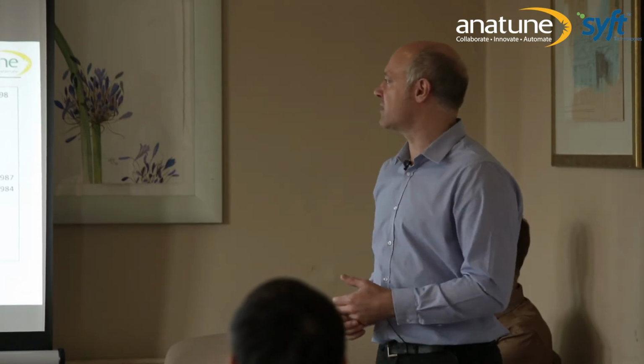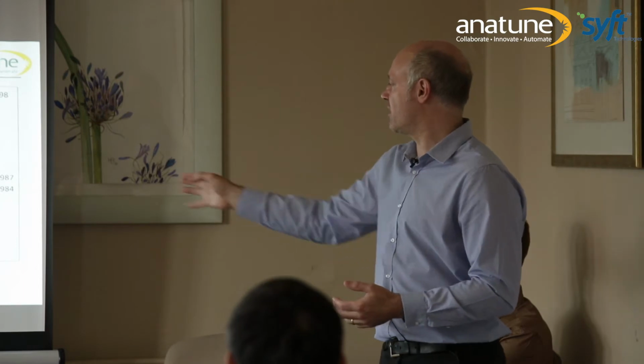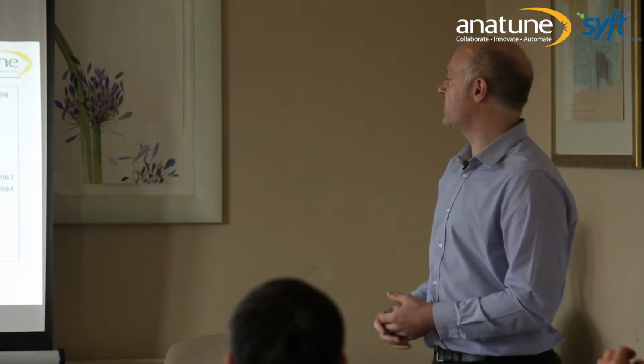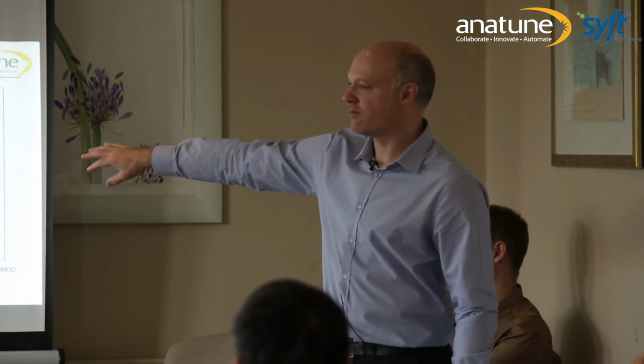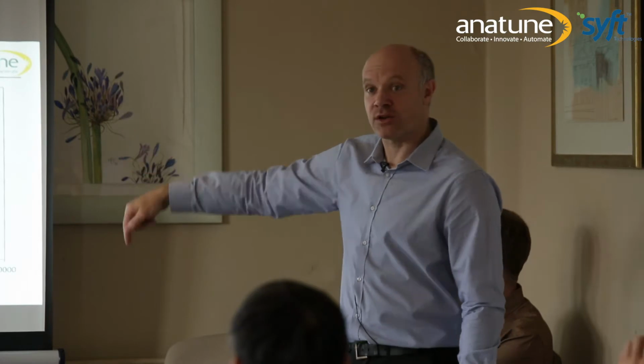I just made up some standards like you saw yesterday, BTEX in water or in sodium chloride, and ran my linear curve, concentration range from about 10 ppb up to 2000 ppb in solution, and you can see we get some good linearity. But we did see the same thing we saw with that formaldehyde method. If you look again, this is another approach to plotting recoveries. We weren't recovering very good concentrations at the bottom end of this curve. In fact, we were under recovering this time.